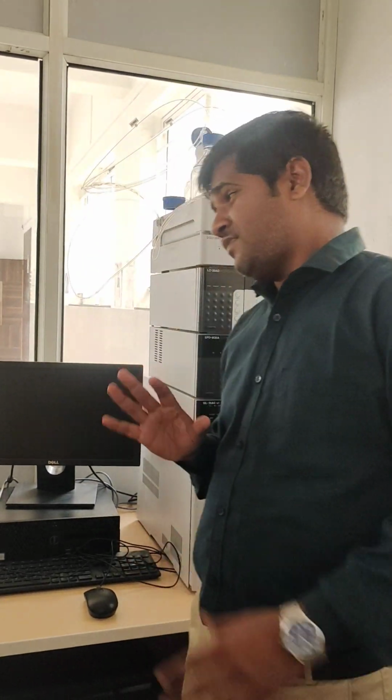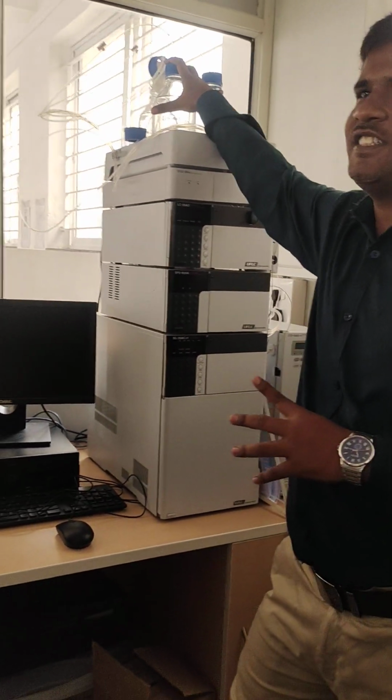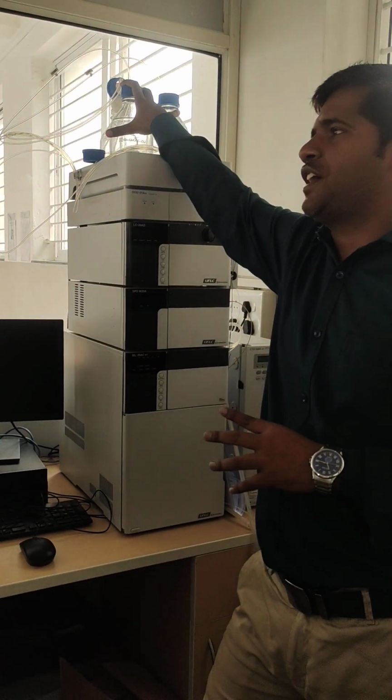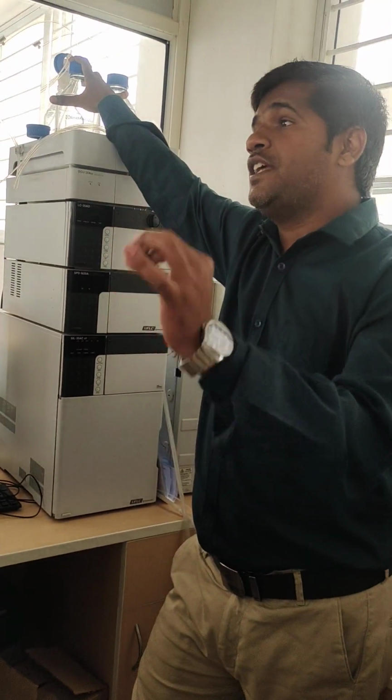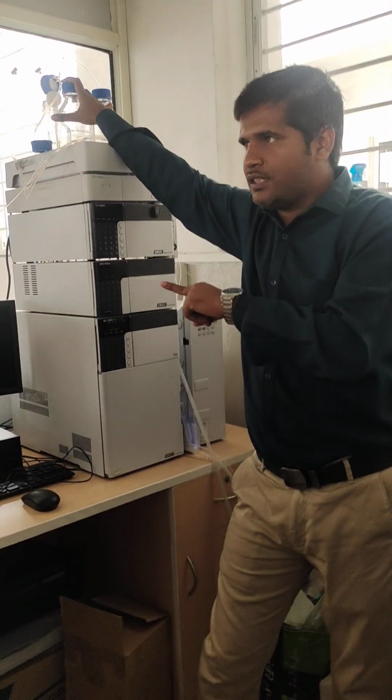Partition, isn't it? Then the parts of HPLC. How many parts of HPLC? The main part is the solvent reservoir. What is that? Solvent reservoir. It means we are providing the mobile phase with the help of the solvent reservoir.